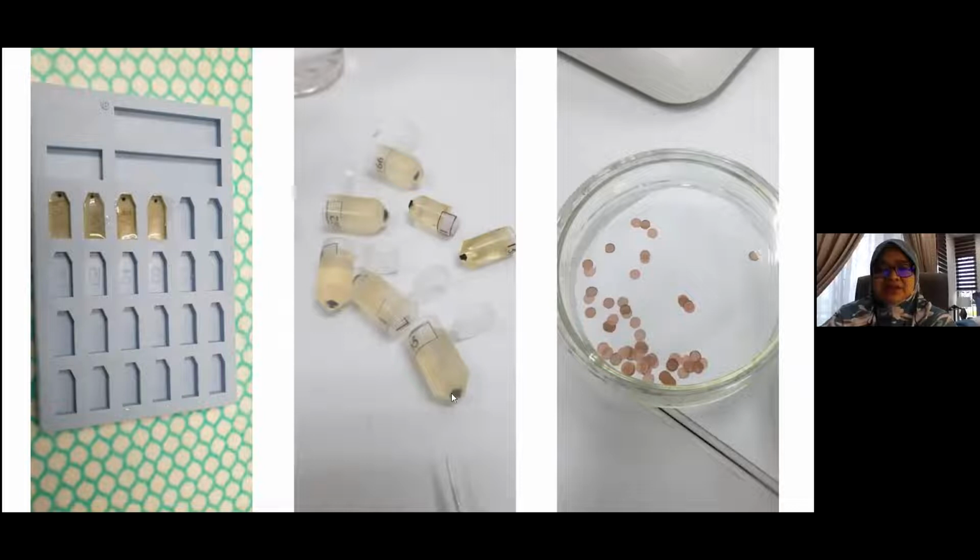The end of this pencil-like resin block is where we put it on the ultramicrotome and do the sections. This is the copper grid, where we place the very tiny sections. It's about 200 mesh actually, if you see under the microscope.